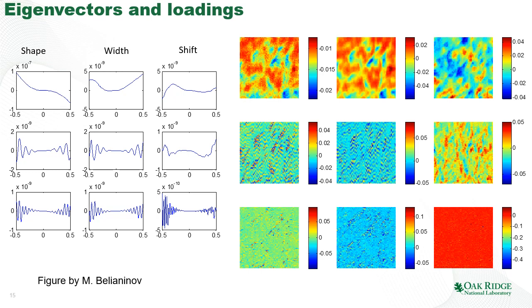If you imagine the combination of the first and second components, you will see that the IV curve becomes slightly broader. The third component is roughly the shift of the IV curve. So the second is the expansion and contraction of the band gap, and the third is the shift of the band edge.